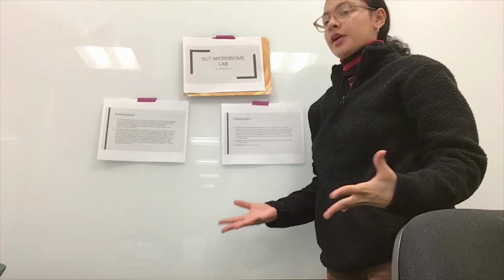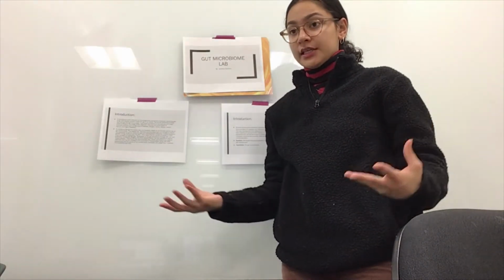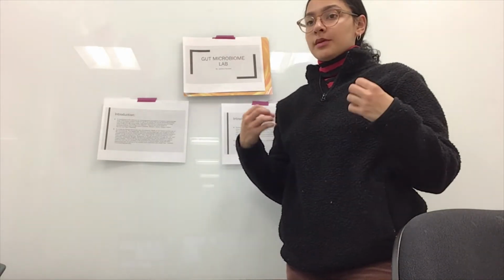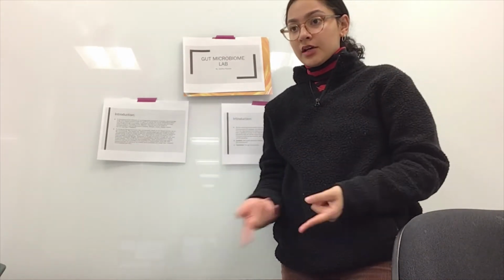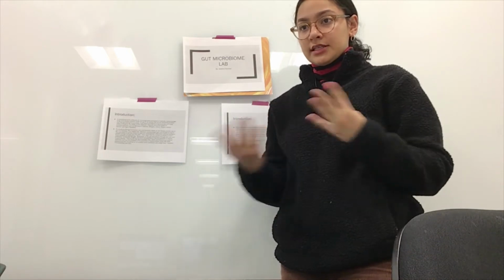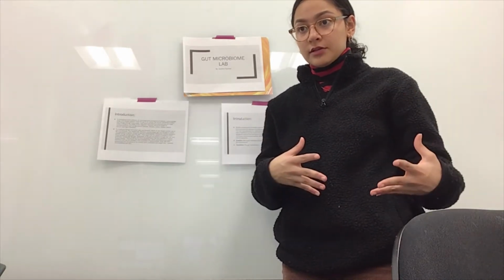To introduce my project, we're going to be talking about what a gut microbiome actually is, and in general, what a microbiome is. A microbiome is the collection of microorganisms, whether composed of bacteria, bacteriophages, fungi, viruses, etc., present in the gut of an animal. But in this experiment, we were extracting samples of gut microbiomes from fecal matter.